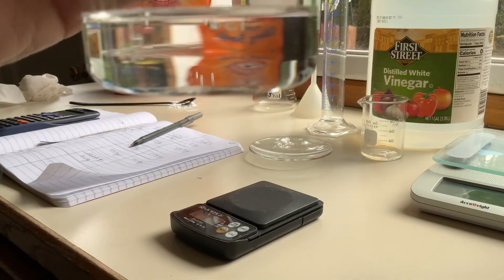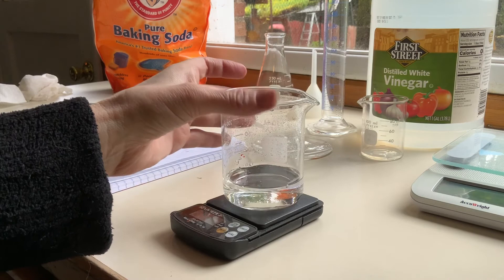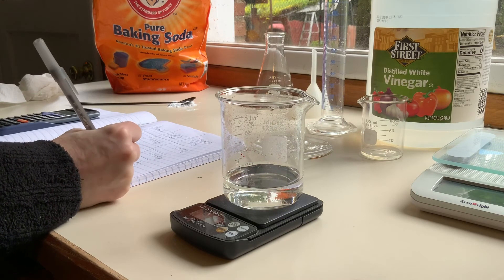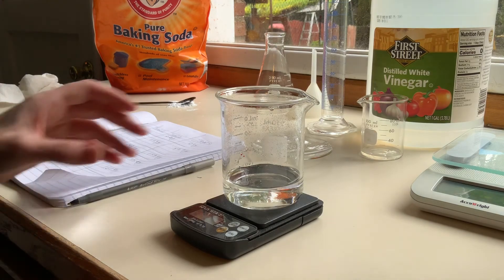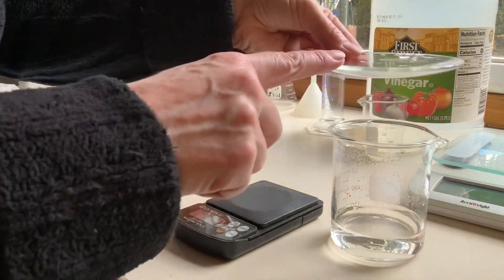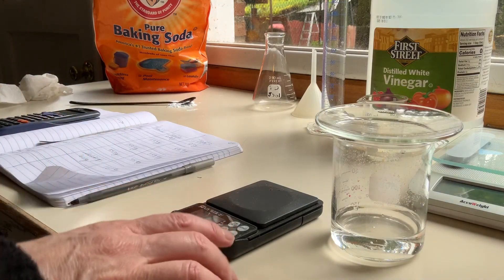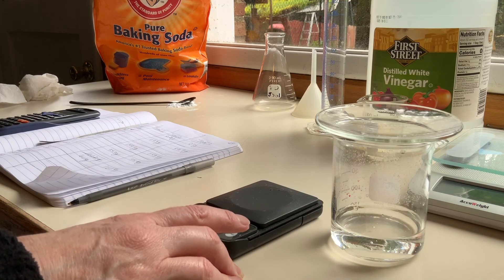It seems to have mostly stopped, so I'll go ahead and weigh it. The balance is tared to zero, and that is 160.7 grams — 160.7 grams. That concludes part A. The only difference from the instructions is you'll have to add the two measurements after the reaction together to get the total mass after the reaction. Hopefully we can talk about that on Monday in lab if you have any questions.